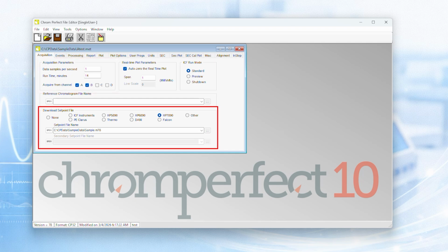You may also see a linked setpoint file on this tab. A setpoint file defines instrument control conditions, such as temperature programs or flow settings. While not every workflow uses them, incorrect instrument conditions can produce scientifically invalid data. In those cases, the sample must also be rerun.